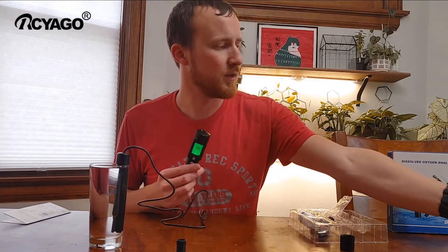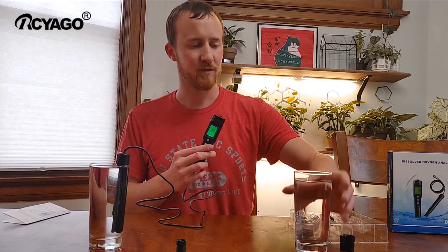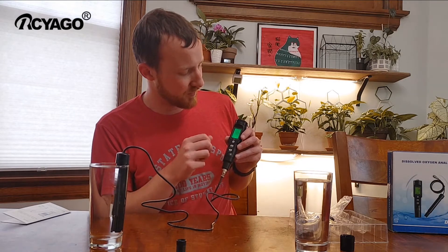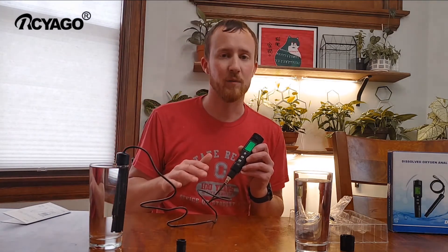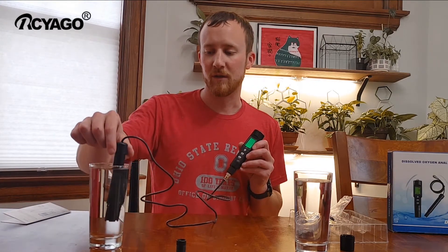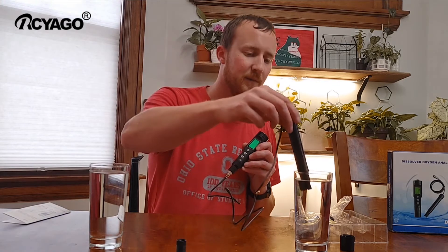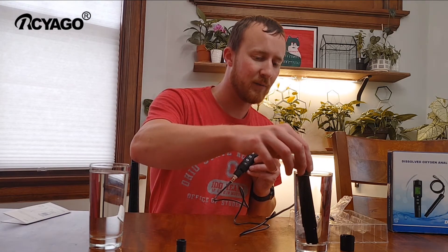Over here I have boiled water, so we'll measure that in a second. It's going down from 83.9% or 7.9 milligrams per liter, and I have not calibrated this at all, so I'm going to switch that over just so we can see it working right out of the package without calibration.